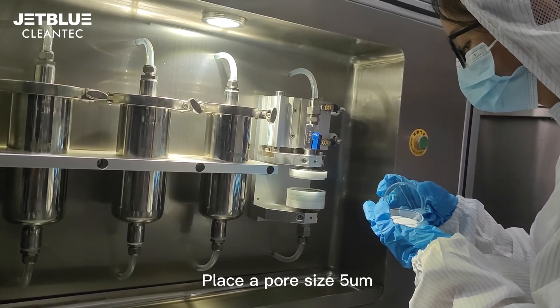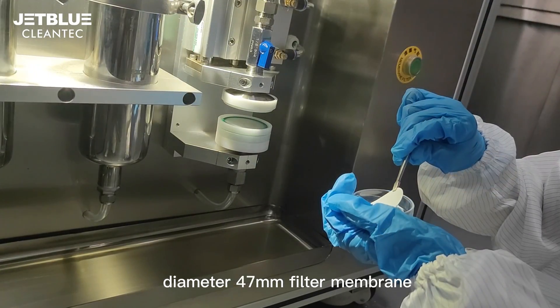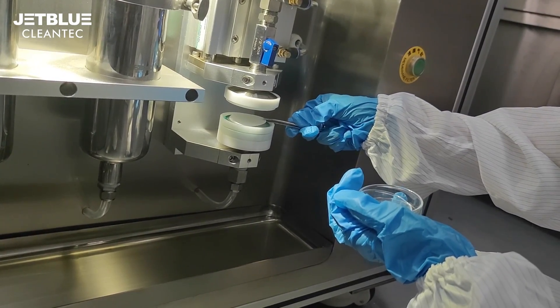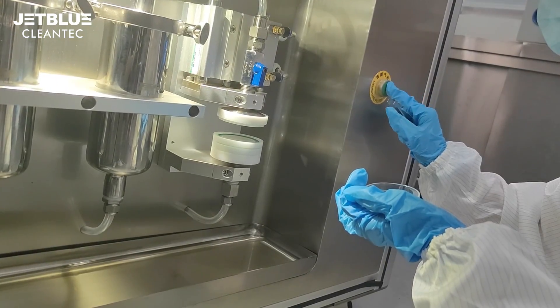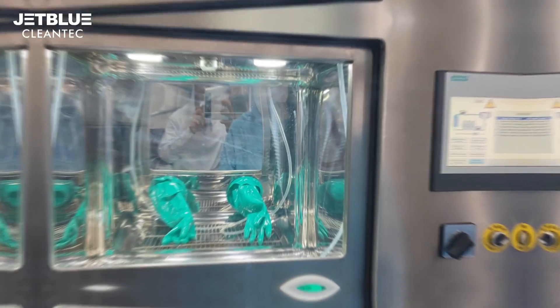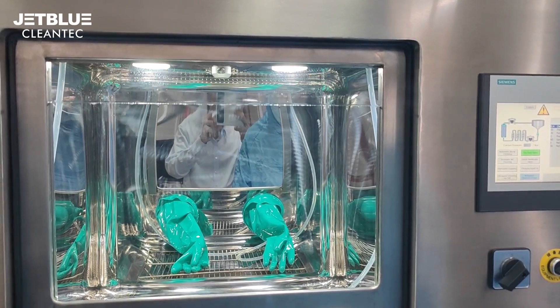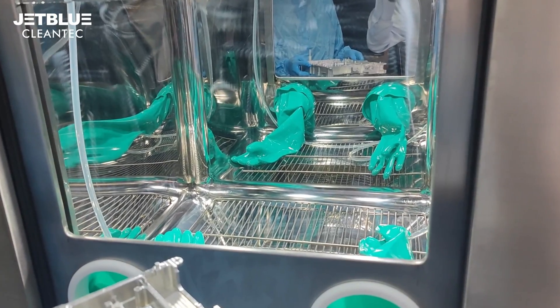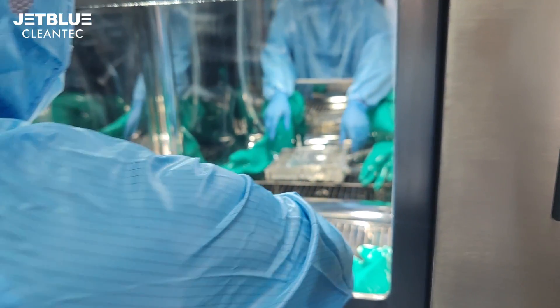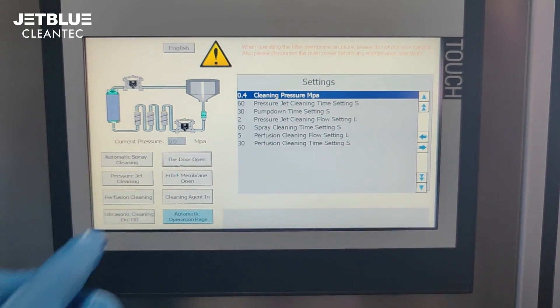Place a 5 µm pore size, 47 mm diameter filter membrane in the filter holder of the technical cleanliness cabinet. Open the door, put the workpiece to be inspected into the cleaning chamber, then close the door.